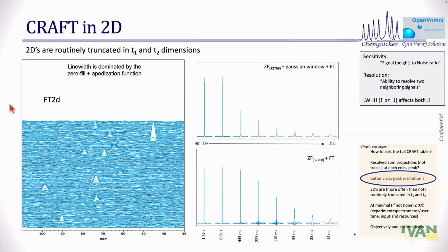Just an FT. So we have these serious sinc wiggles, what we call sinc wiggles, or Fourier transform wiggles, zero filling Fourier transform wiggles, truncation artifact, whatever name you want to call it. So we end up having to put some kind of apodization. In this case, when I did a Gaussian window, everybody is happy in terms of visualization of that FID.